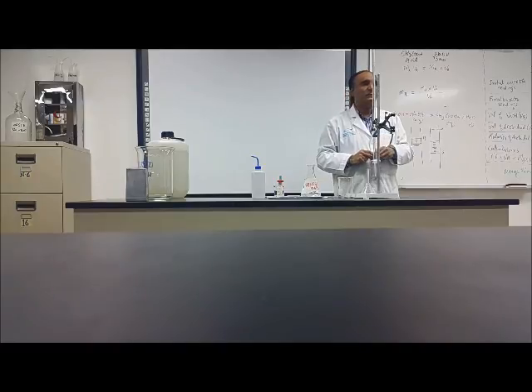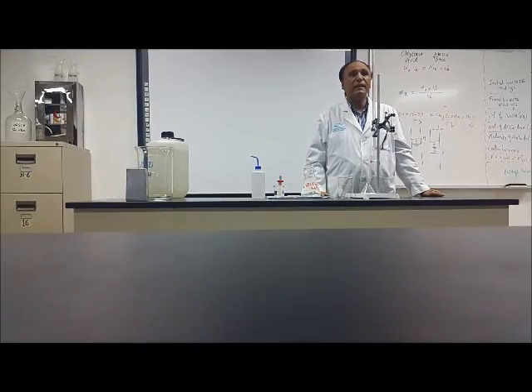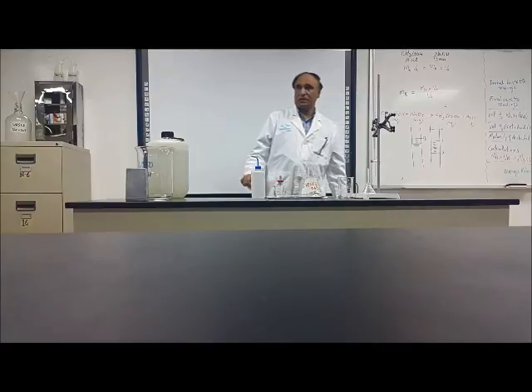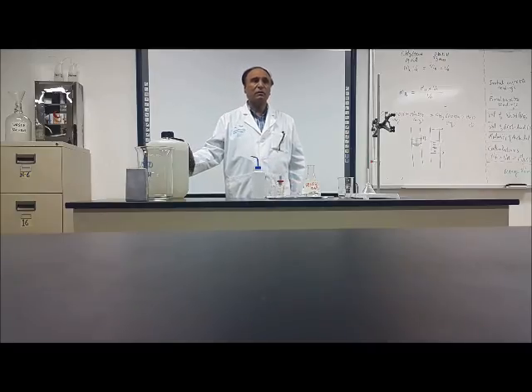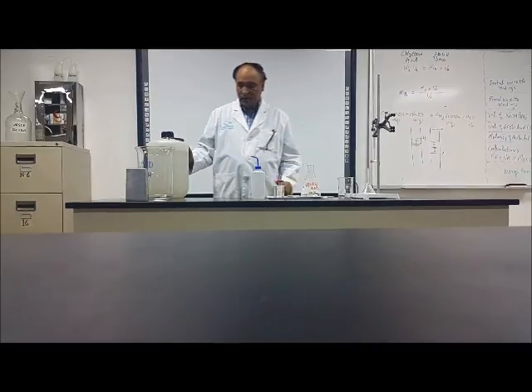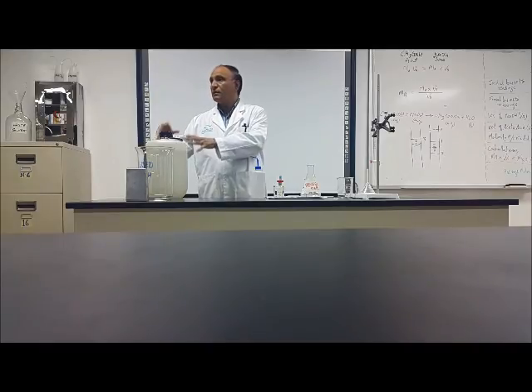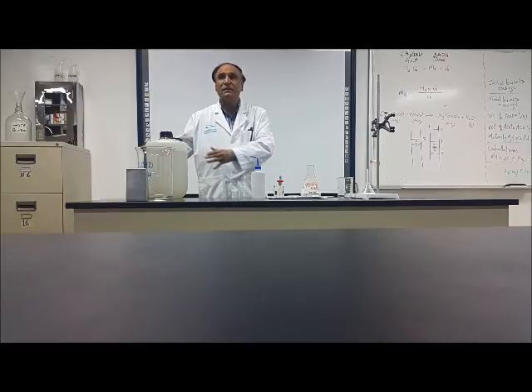This experiment is called standardization of a base. Standardization, you know, is to see what the concentration is. Concentration means tarkis.